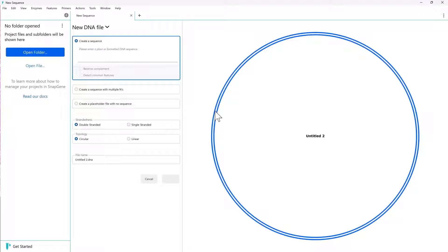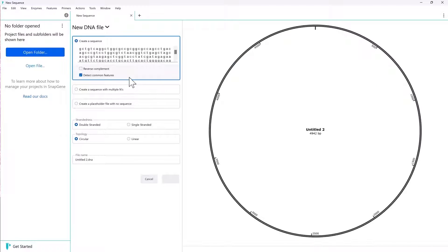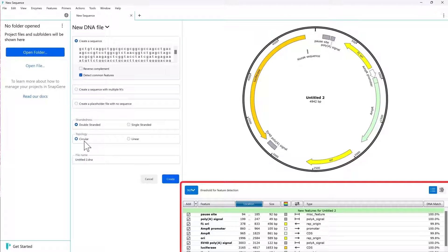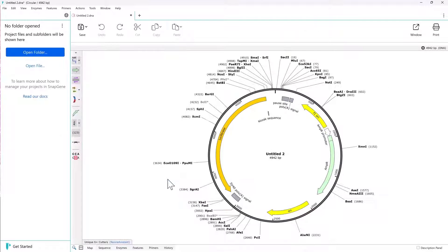Then just type in or paste your sequence into the text field and indicate whether it is linear or circular. SnapGene will automatically detect common features and show a preview of the file. Click Create to create the new file and open the full SnapGene interface.